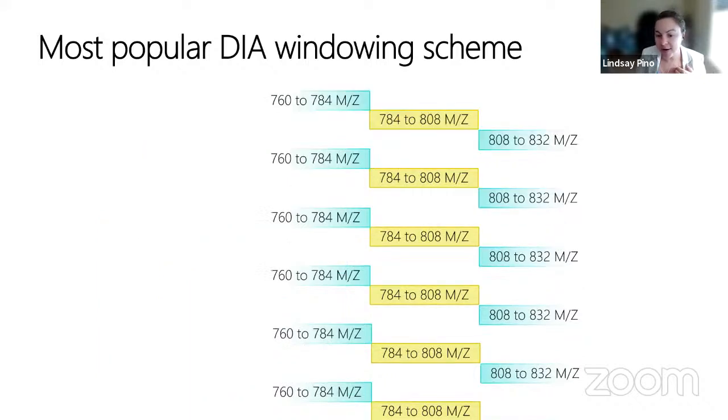So now we build our chromatogram across all of these individual MS2 values. We will see chromatograms, see peptides start from low intensity, build in intensity, and then go down.